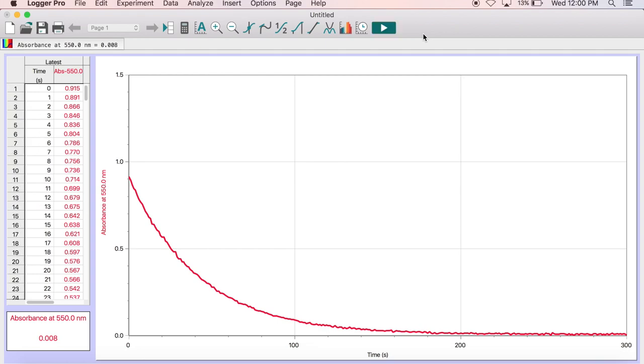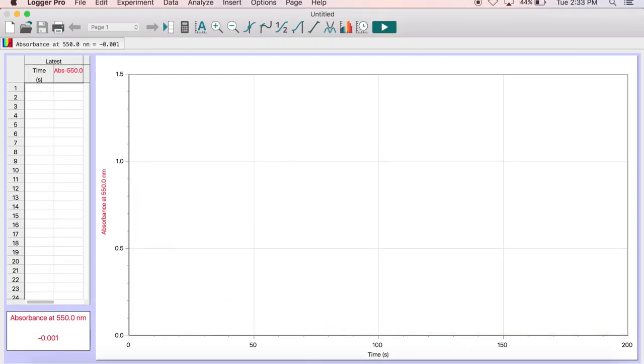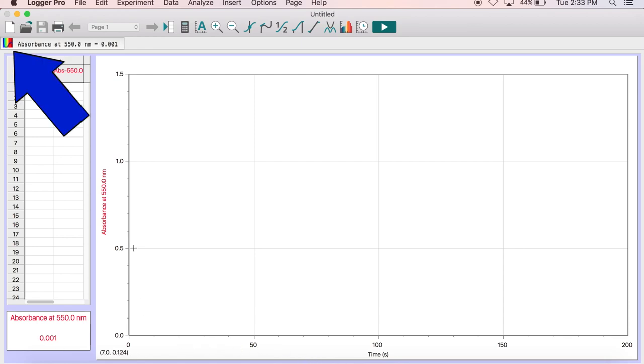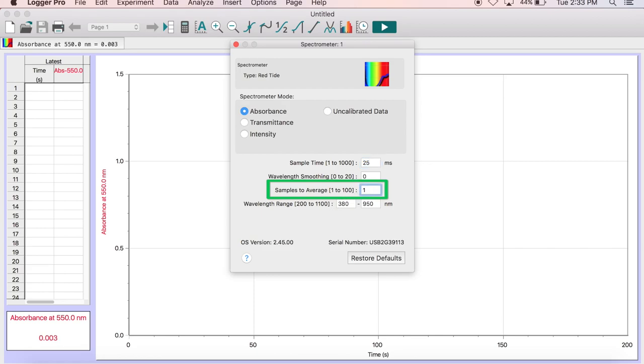Save your data to excel when finished. If you notice the absorbance values start skipping or lagging, you can fix this by clicking the rainbow absorbance icon at the top left of the screen. This will open the spectrometer 1 dialog box, and here you should change the samples to average from 10 to 1. Close this page when you are finished.